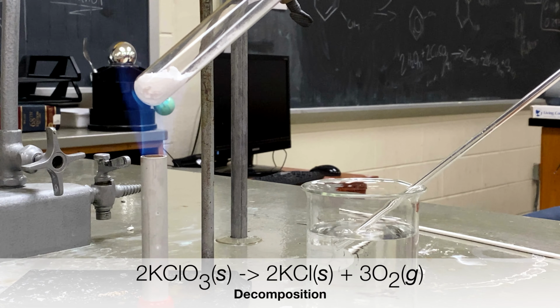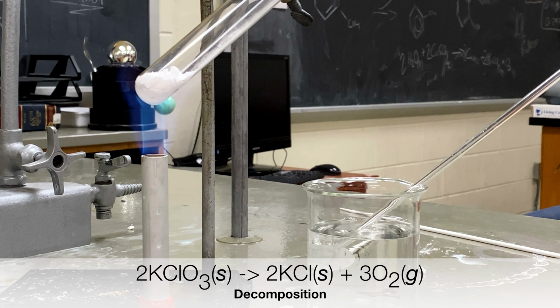As we begin to heat the potassium chlorate, the gas expands, causing some small bubbles to form. Then those bubbles start to slow. What then starts to happen is that the potassium chlorate turns from a solid into a liquid as the intense heat starts to melt it. The small bubbling that you see occurring is again just because the gas inside the tube is expanding. But we'll want to notice what happens next: we'll all of a sudden see the reaction start to take place.